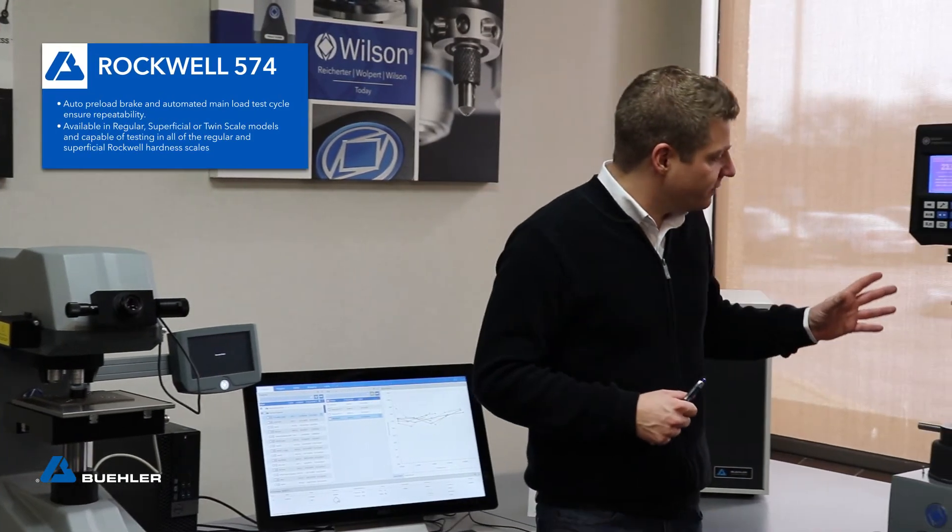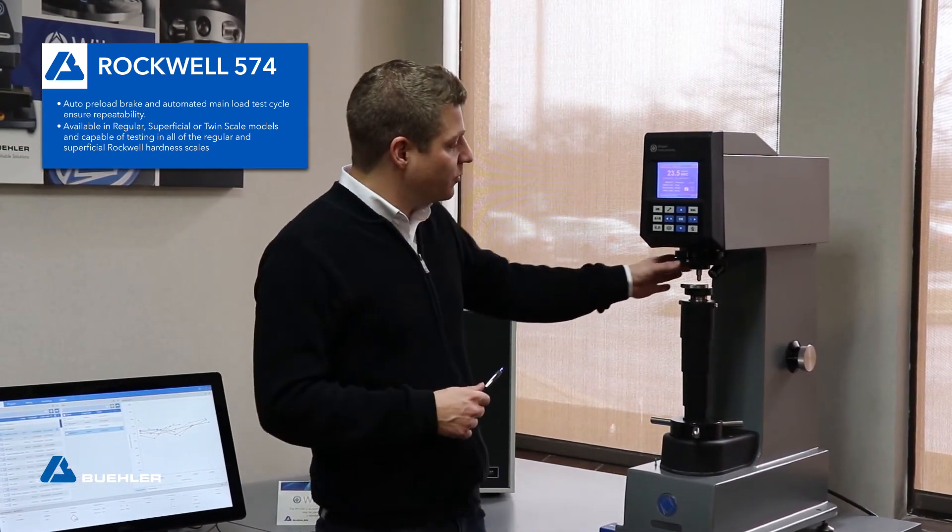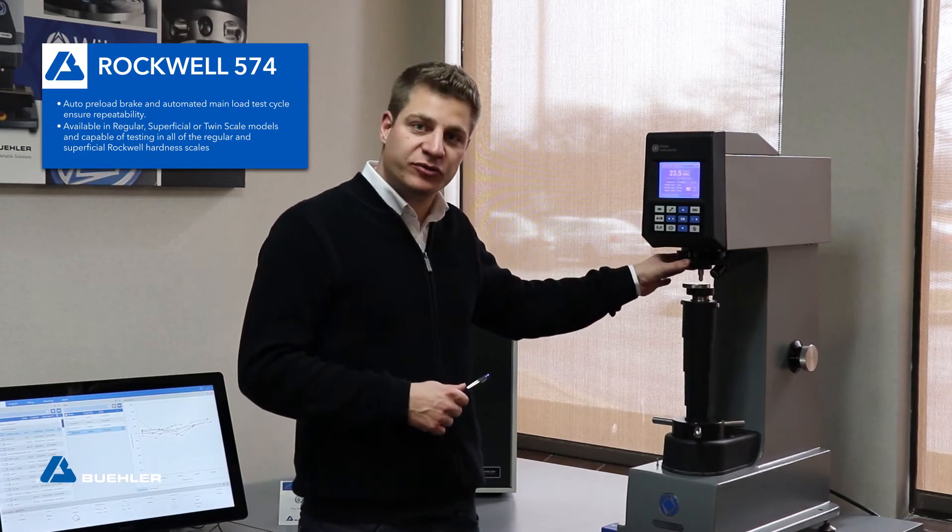Our Rockwell 574 is our deadweight Rockwell tester for regular and superficial Rockwell scales, and it has an automatic brake for the preforce. So testing gets really simplified for the operators.